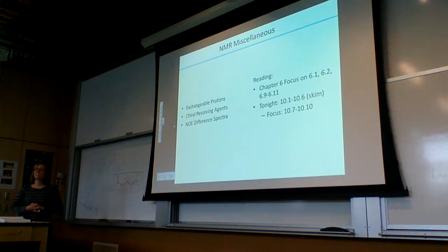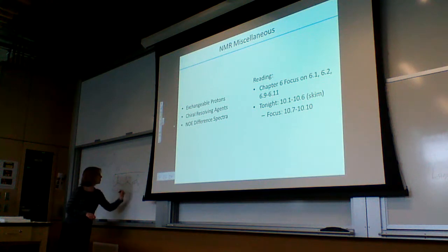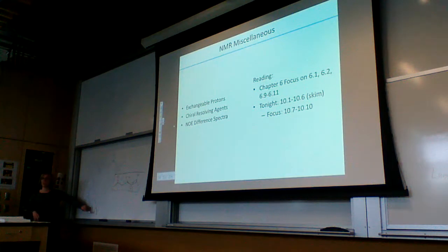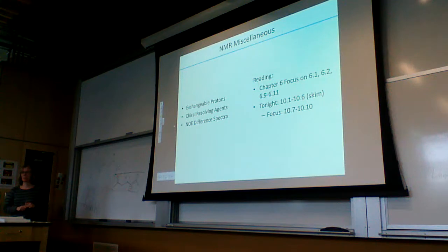So is that splitting just for the hydrogen that we were talking about? Just this one. The whole honeycomb? Yeah, that would be the one at about 5.8 here. Which doesn't quite line up because it has different J values than I'm actually drawing up here. Also, this is the number of splitting tiers you'd have to do on a tree diagram, but it's not the exact representation because my J values aren't measured. I just pretend.